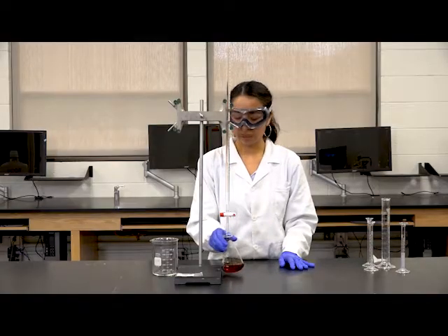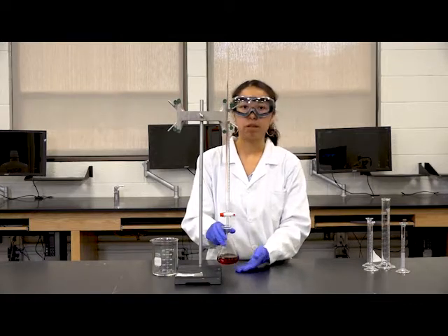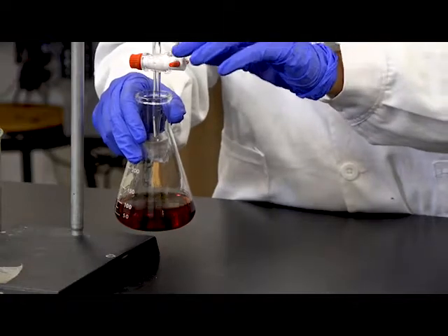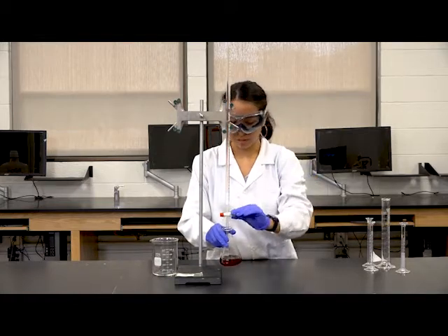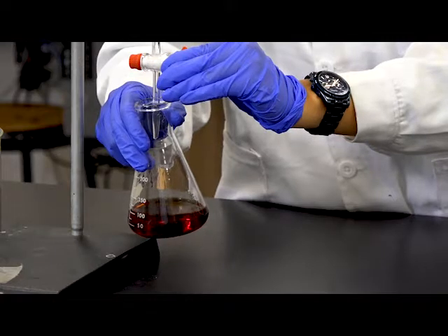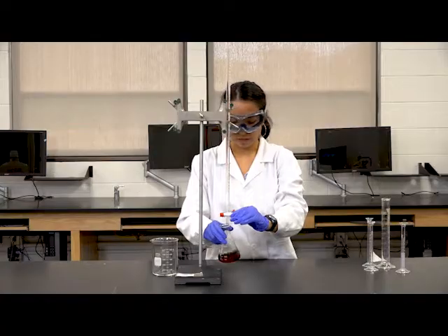Once you're ready to start your titration, the first thing you need to do is place the Erlenmeyer flask underneath the burette, and you're going to open it slowly. Make sure to record that you're starting from 0 and then record the final level that you reach after the titration is done. You slowly open the burette to let the flow go so you won't miss the titration.